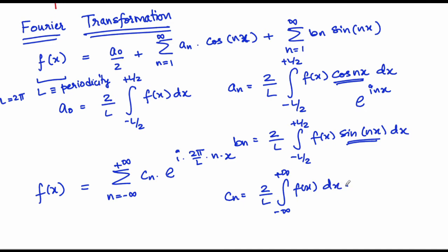And what you are able to understand here is that in the Fourier series, you can only go in integer numbers, meaning you can go 1, 2, 3 and so on. You cannot have a number between 1 and 2. And it is also restricted by the fact that the function you are trying to represent has to be periodic.